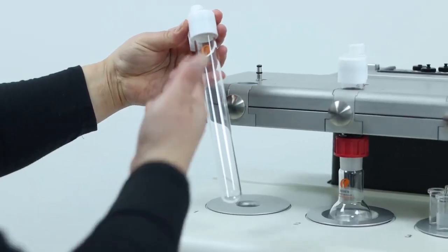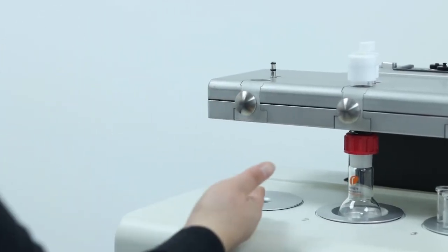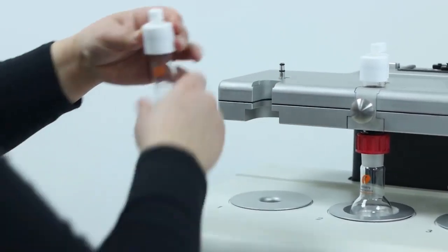If you wanted to reflux an inert tube, it would have to be the specific tube in a single position insert.